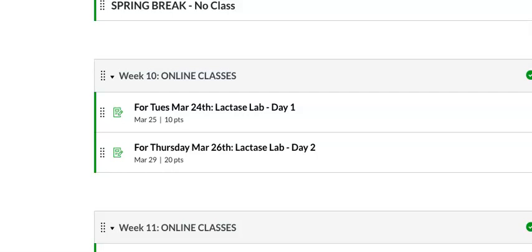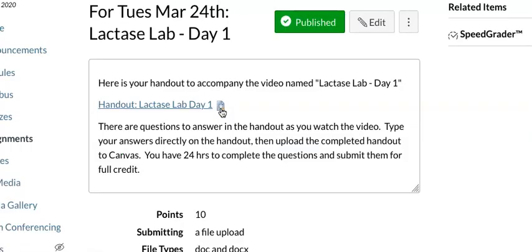Today's video will involve our virtual lactase lab exercise. I'm on Canvas right now, and this is the view of the week 10 module, the beginning of our online classes. And where it says for Tuesday, March 24th, Lactase Lab Day 1, go ahead and click. That brings us to the link for the Lactase Lab Day 1 handout. Go ahead and click that as well.